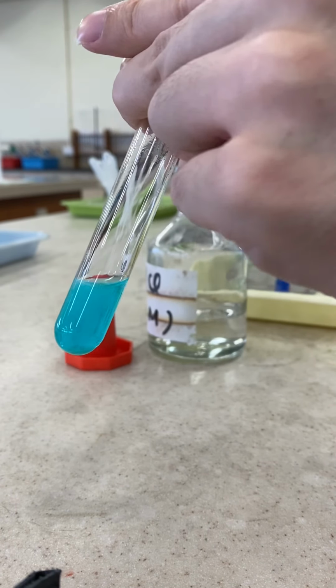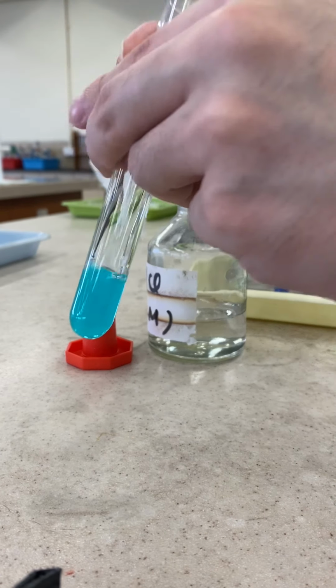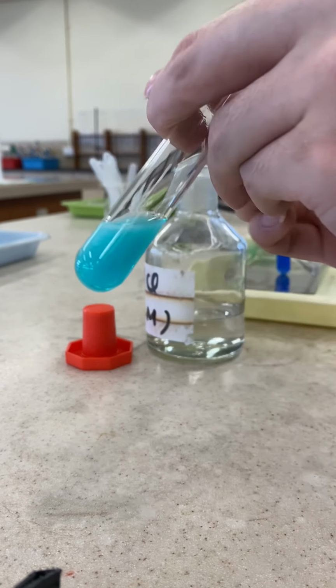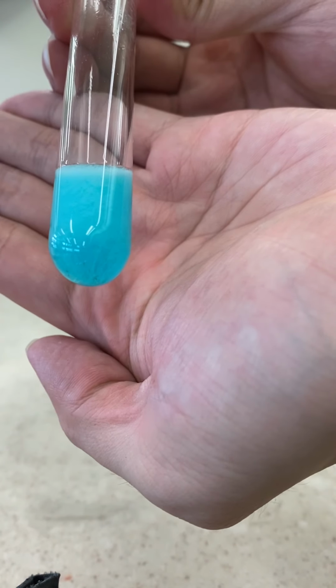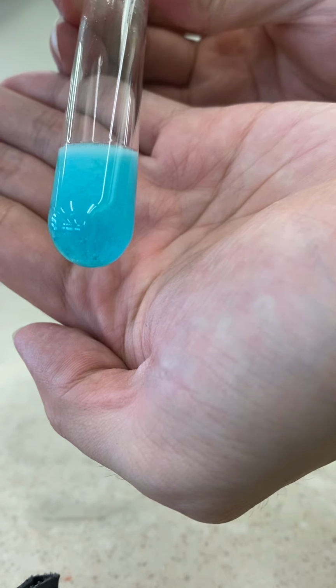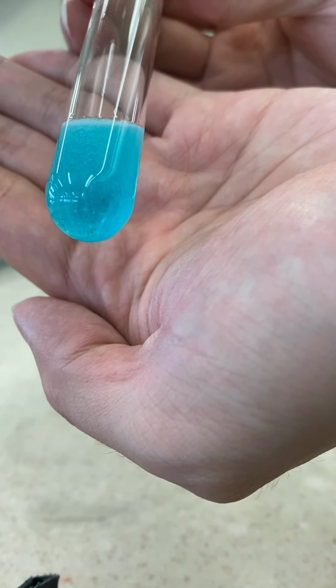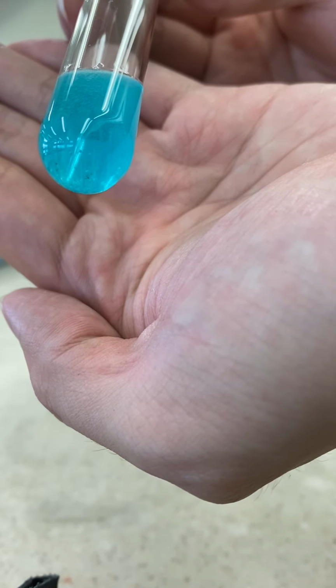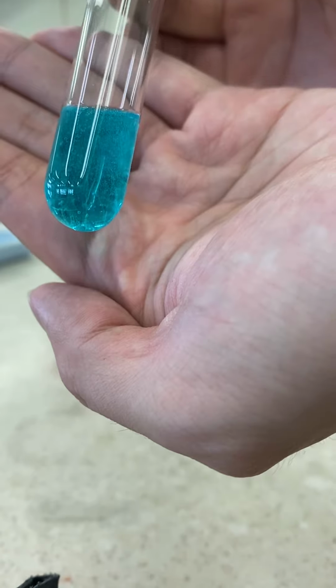I add enough acid to ensure that most of the carbonate can react. As you can see, at the bottom it is still reacting, and there is still some green solid of copper-2 carbonate. But you can see that there is a decrease in the size of the copper-2 carbonate.